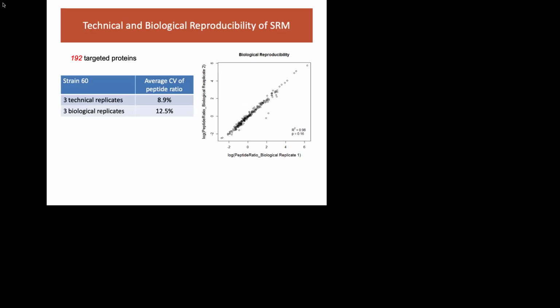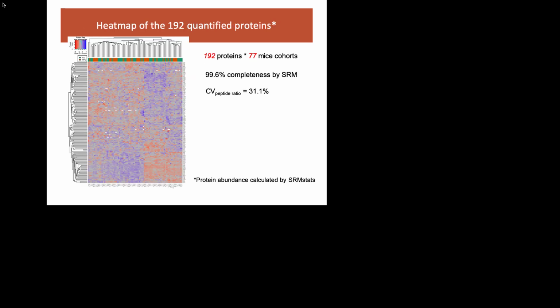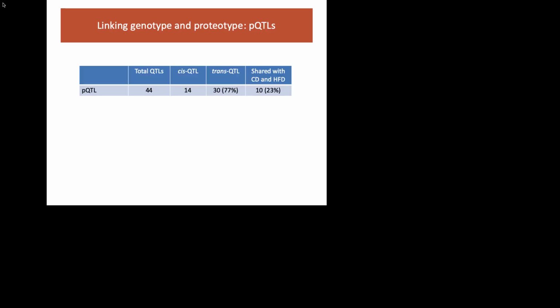And then we can now relate the protein abundance. So we have now basically protein abundance measured over a number of mice. And we can relate this by association, basically correlate the abundance of proteins to the presence of a particular allele in a particular locus. And this is referred to as quantitative trait locus analysis. This is the summary sheet of the data, and this is what the results show.